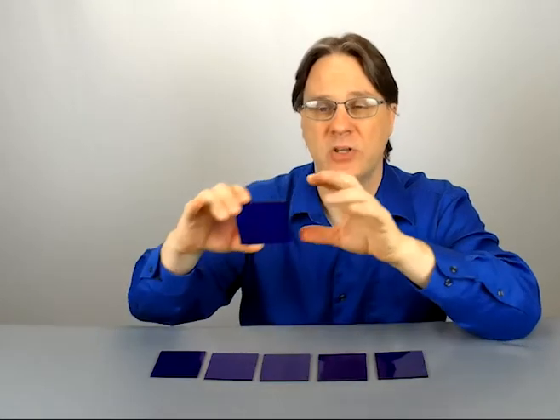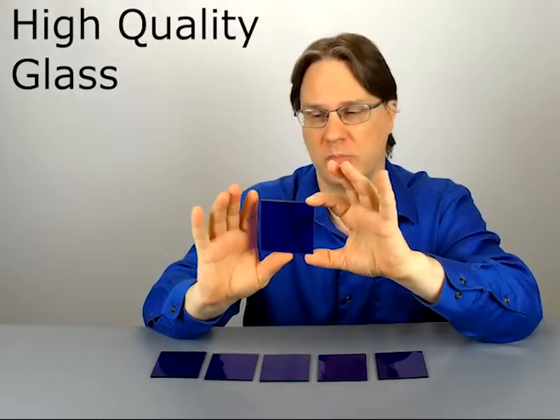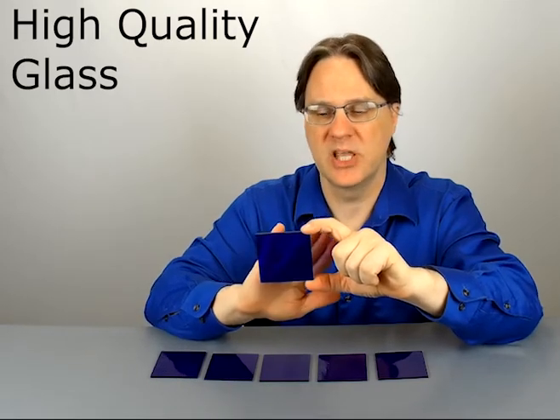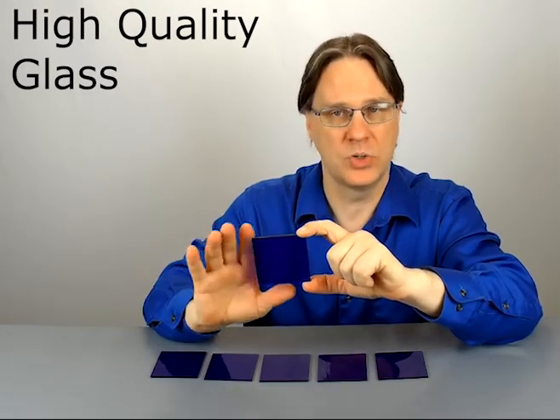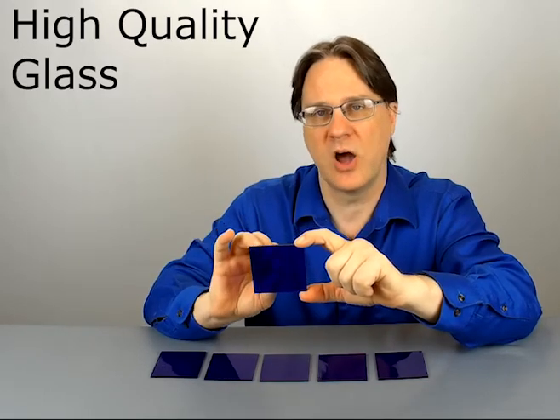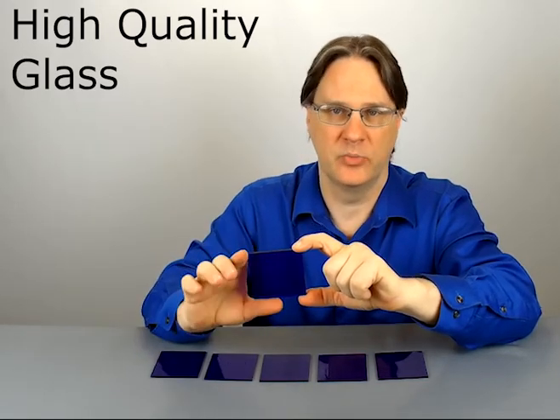The advantage of having a good high quality cobalt plate in your classroom is for when you're doing flame spectroscopy — this helps block out those strong orange colors so you can focus on seeing the violet tones that are often hidden by the other brighter colors.